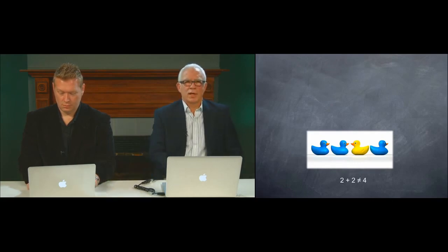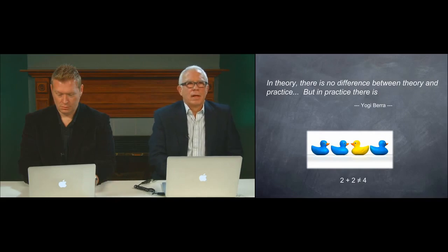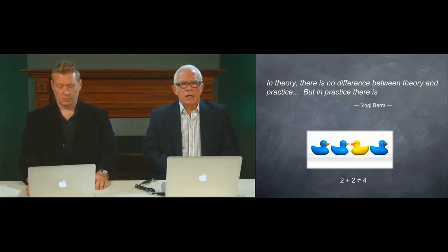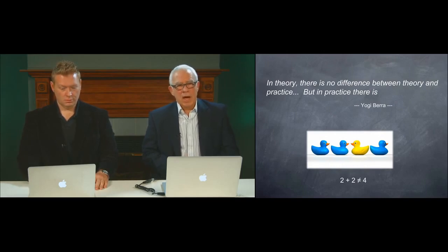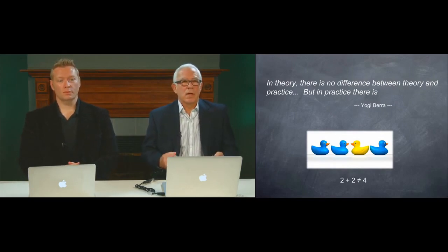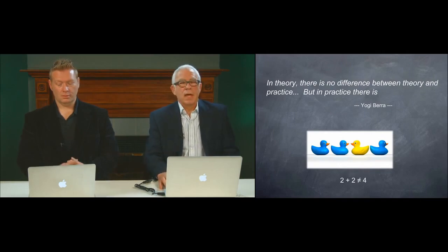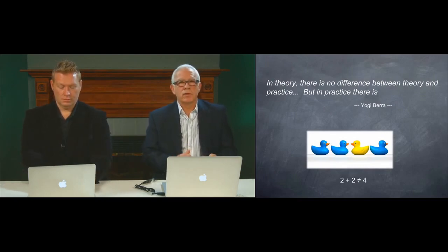Math is not always what it looks like. In theory, there's no difference between theory and practice, but in practice there is. So today, my goal is really to show you some very easy to apply, practical and convenient ways to apply aseptic rodent surgery. Now, can I say that I can absolutely keep my animals 100% contamination free? It's not possible. I don't think it is possible or even practical. But by applying these principles, even though I may not be applying in practice what I teach 100% in theory, I look for the implementation of everything that I can to improve my surgery results.